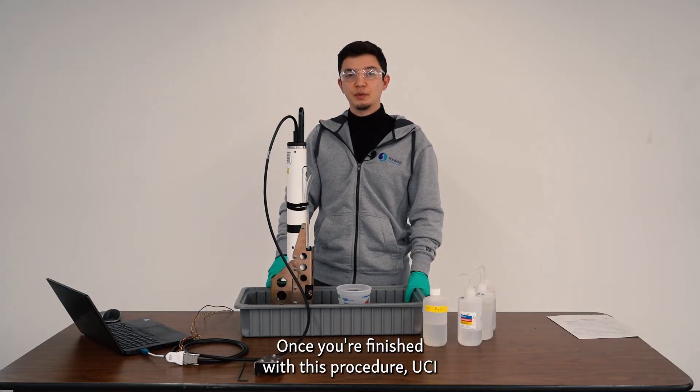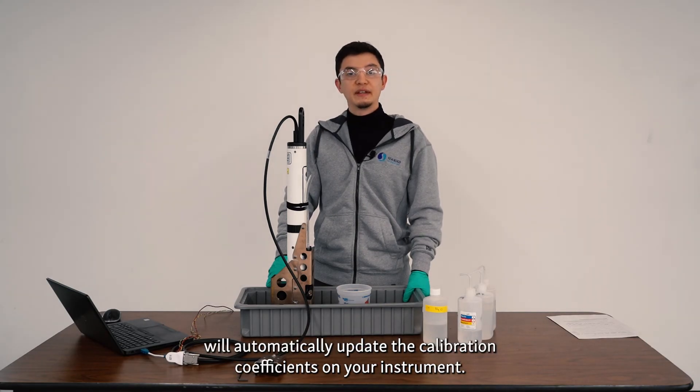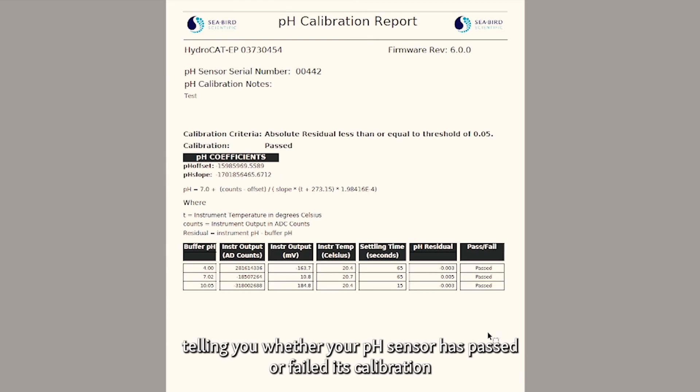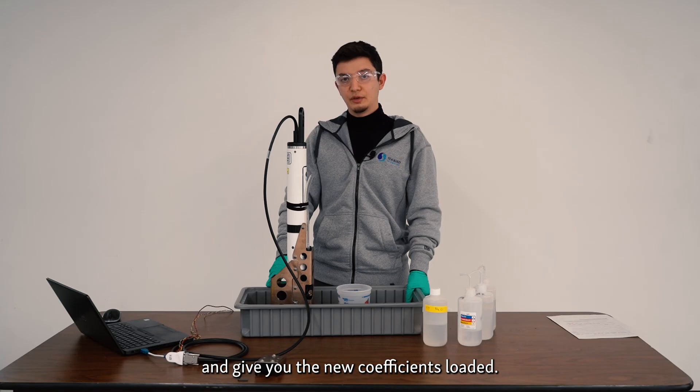Once you have finished with this procedure, UCI will automatically update the calibration coefficients on your instrument. UCI will also give you a PDF pH calibration report telling you whether your pH sensor has passed or failed its calibration and give you the new coefficients loaded.